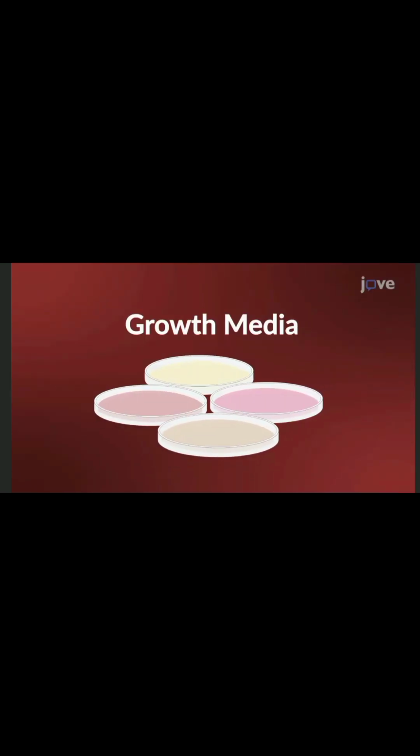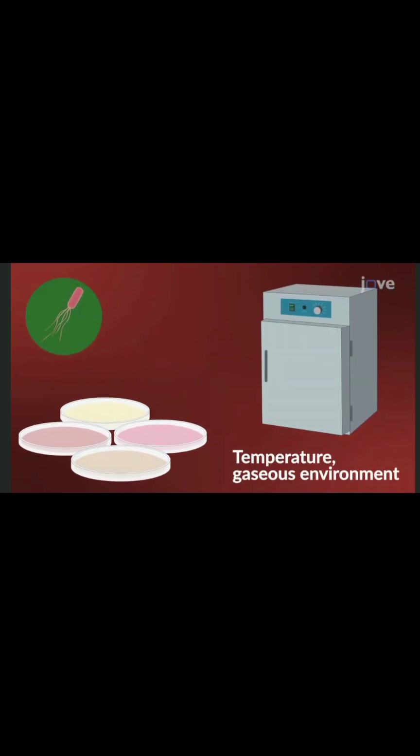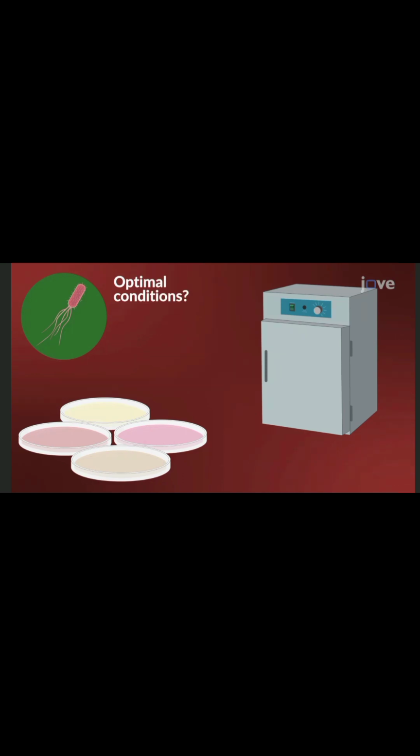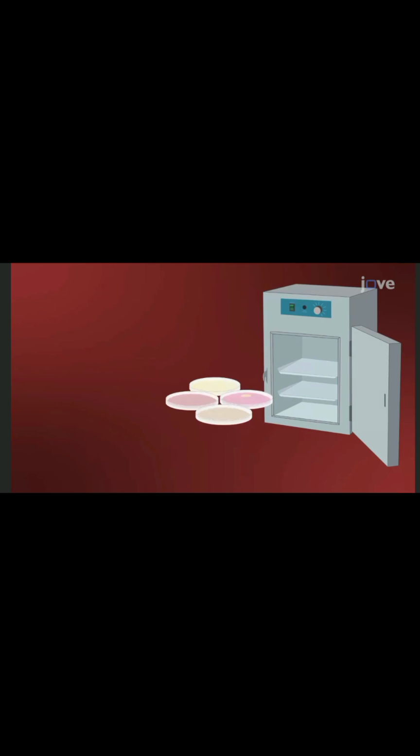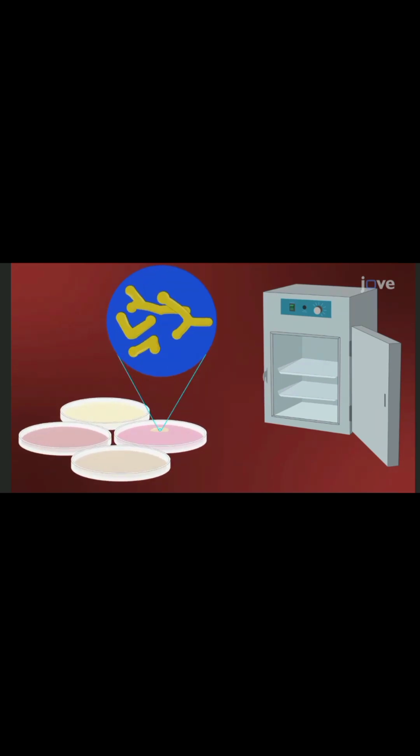Performing manipulations of media and environment in the laboratory not only allows researchers to experiment to find the optimal conditions for culturing a species of interest, but it also enables enrichment, the process of changing conditions to select for specific species from a mixed culture. Some microbial species are generalists and able to tolerate a wide variety of states or environments. Such organisms may grow readily under laboratory conditions, but they may also be prevented from growing if given an extreme habitat, which can help if the goal is to enrich for organisms from a mixed culture which are tolerant to this condition.